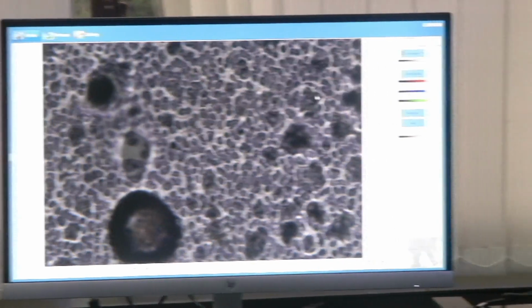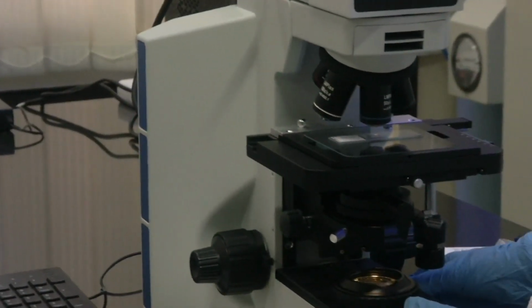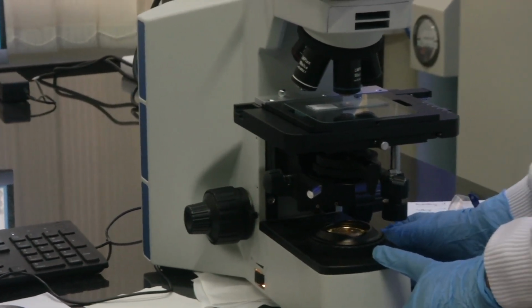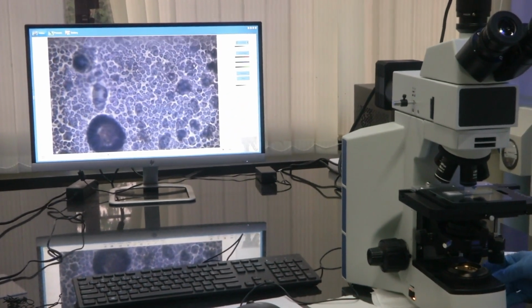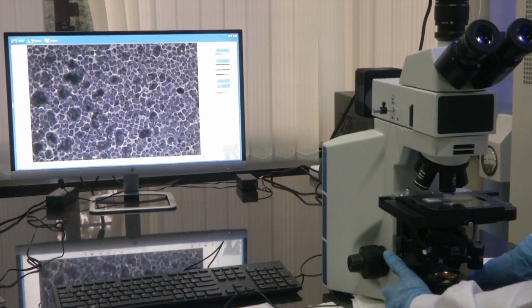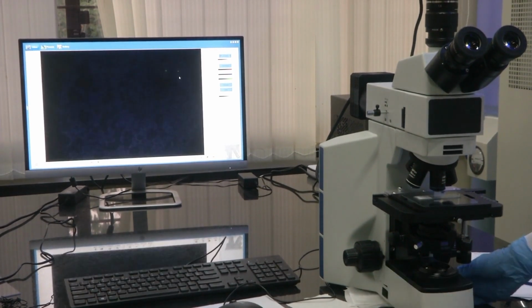See, the light at the bottom is blinking and top illumination is not used. Suppose I switch on top illumination, I can even have both illuminations at the same time. See, the image is getting brighter. I have used top illumination. And you can even have only top illumination. Let us say I switch off the bottom illumination and you work with only the top illumination.